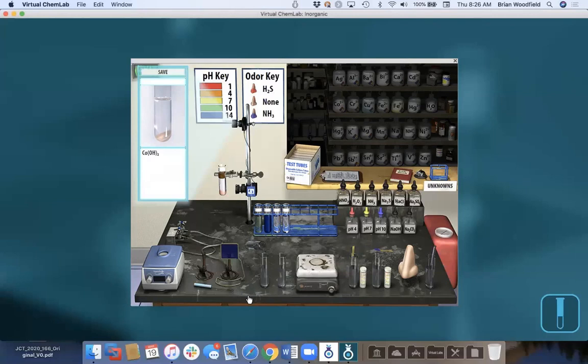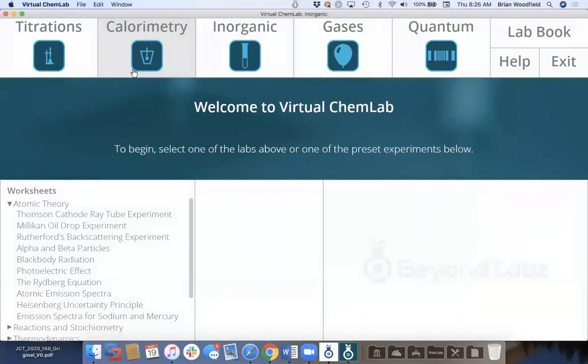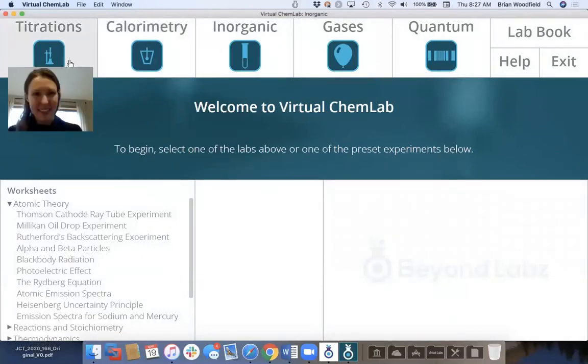And so this is classic. This is just a classic inorganic lab, and you can do any level you want with it. So any questions before I go on? Feel free to just unmute your line if you want to directly ask a question. There have been several questions on the lab notebooks.